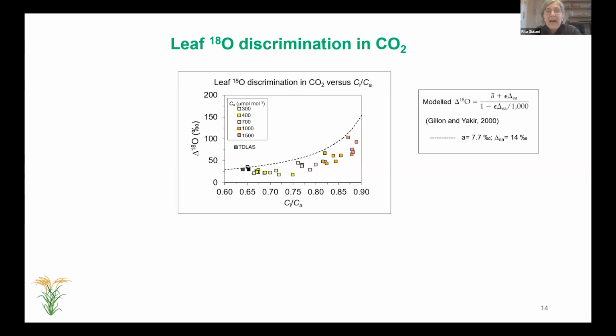And if we add, these are mean values of comparable experiments. When I say comparable experiments, I mean the same plant material under the same environmental conditions. We have 3 TDL experiments, and these are the mean values.